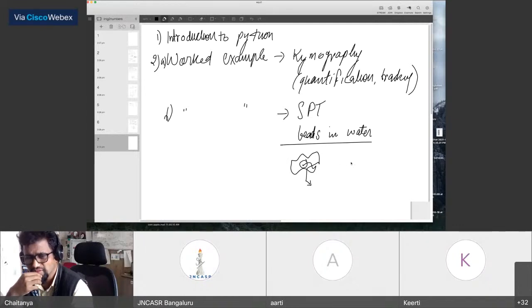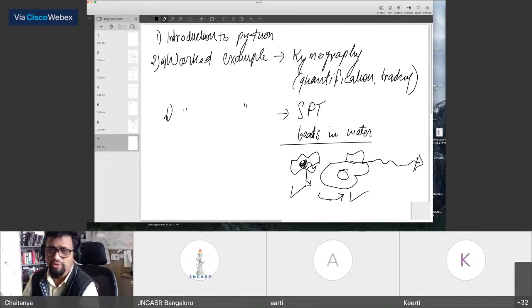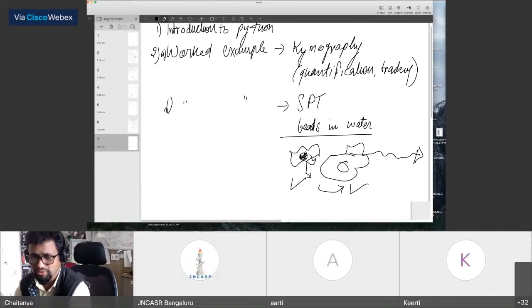Because of course a chemotaxing cell will probably behave in a more directed manner, but in a way it's a little more challenging at a high density to look at granule motion and follow it, because if this works, this is your control case, then we have a high hope of this working too. Okay, so this is how we're going to structure this afternoon.